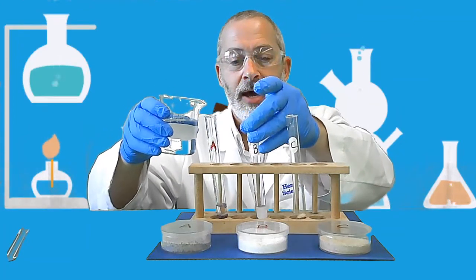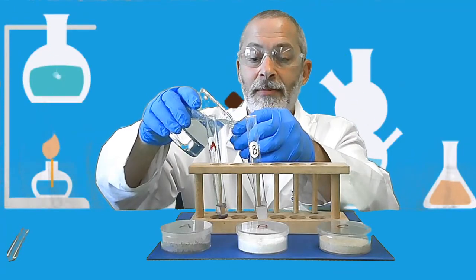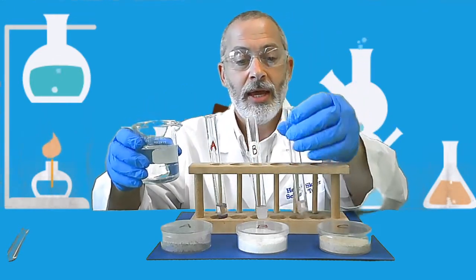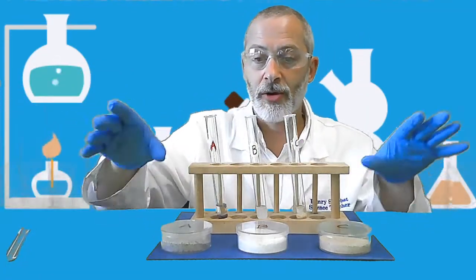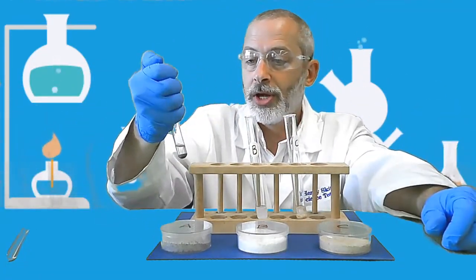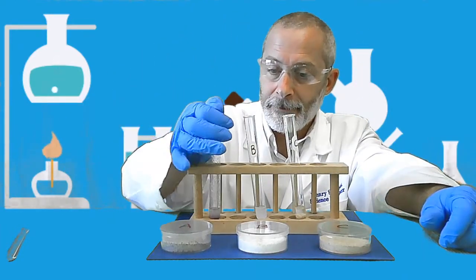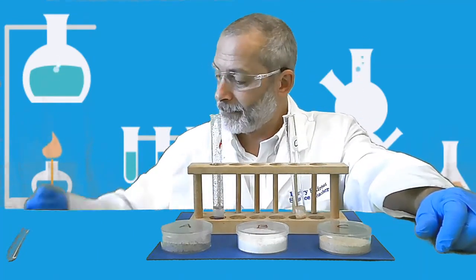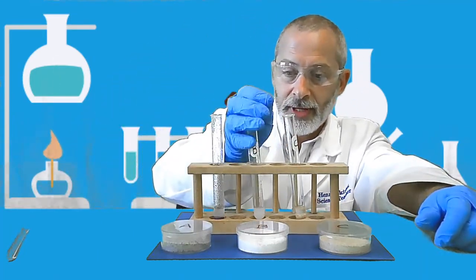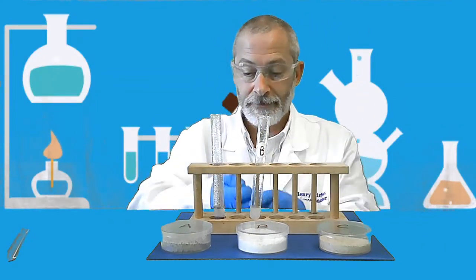And then I'm going to agitate and add some oxygen, and we'll make some observations. So we've got all three of them ready. Here we go. Test tube A, test tube B, and test tube C.